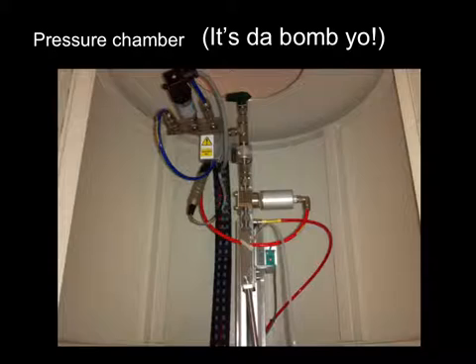And so as I mentioned, you don't want to touch up here. It's going to be pretty hot, and there's some warning signs up here. So basically this will shoot down through one of those tubes in the dissolution wand, and then come out, and it'll go into your flask, and you get your solution out. So let me emphasize again, the only thing up here you want to touch is this green valve that will open and close the bomb.